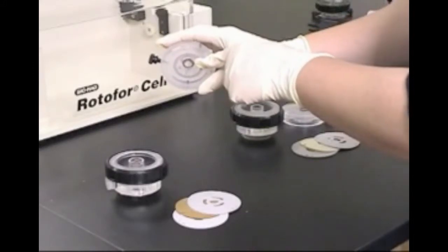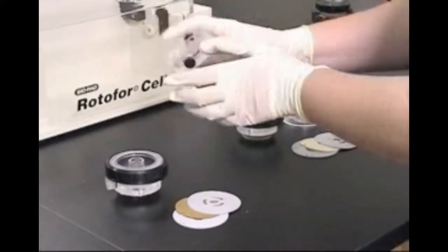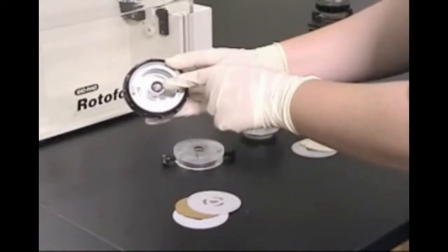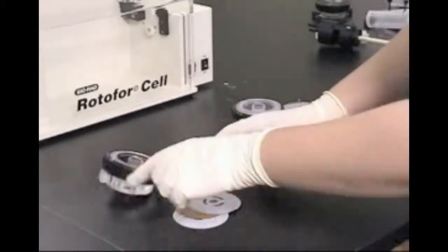Before each run, make sure that on the inner component there are two O-rings: a small one around the central shaft and a larger O-ring on the other side. The outer component should also have an O-ring on the central shaft. These O-rings seal the electrolyte solution within the chamber.